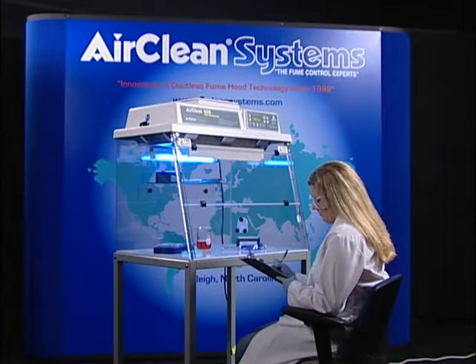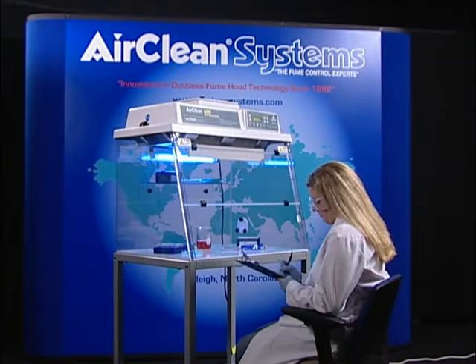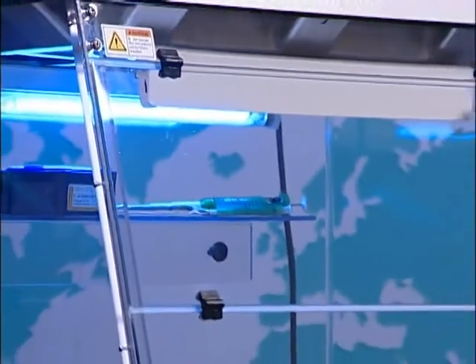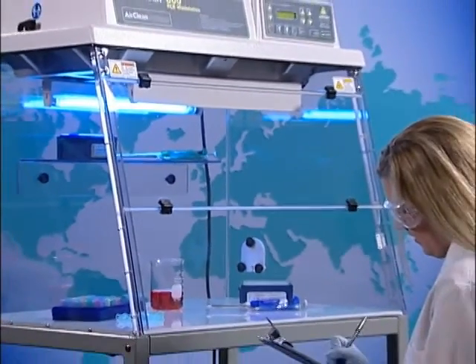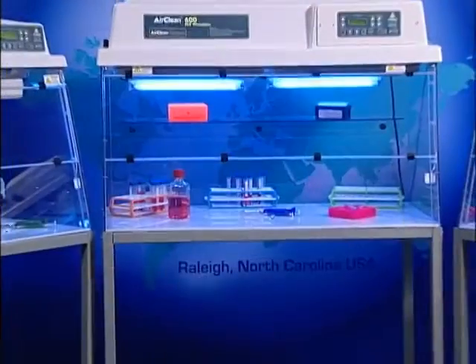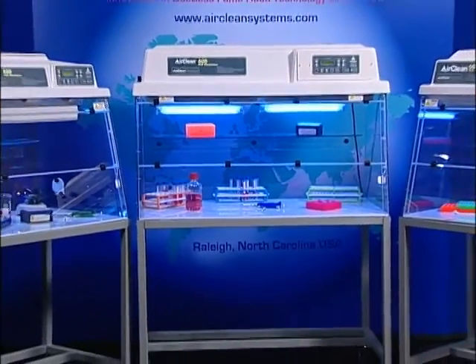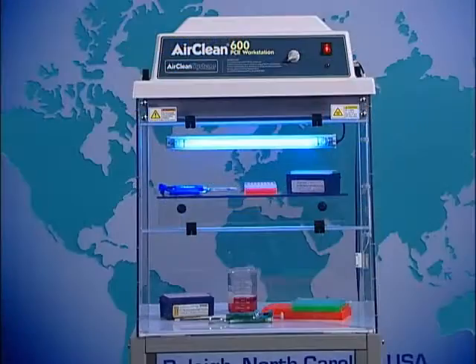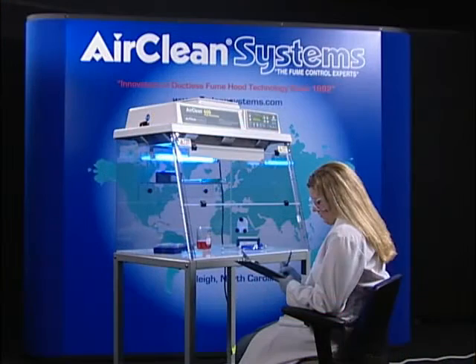AirClean Systems PCR workstations are designed and constructed with the application and operator in mind. The application requires the use of shortwave UV rays to sterilize the workspace between amplifications. Shortwave ultraviolet energy has been found harmful to humans at certain exposure levels. The workstations are constructed from polycarbonate that effectively reflects shortwave ultraviolet energy, and the body is constructed in a single piece to eliminate potential gaps that would allow harmful UV energy to escape into the operator's work area.